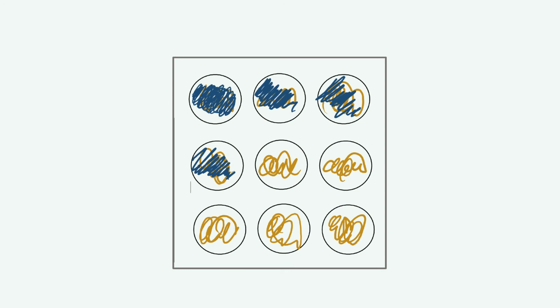But then let's say we add some of our solution after 2.5 minutes to this well, and it stays orangey brown, stays the color it already is. That means that there is no starch left, okay? The iodine has not caused the starch to turn the solution blue-black, and therefore our reaction has finished. And so we'd stop our timer and say, there we go, reaction done. We can mark down that time, and we are done.